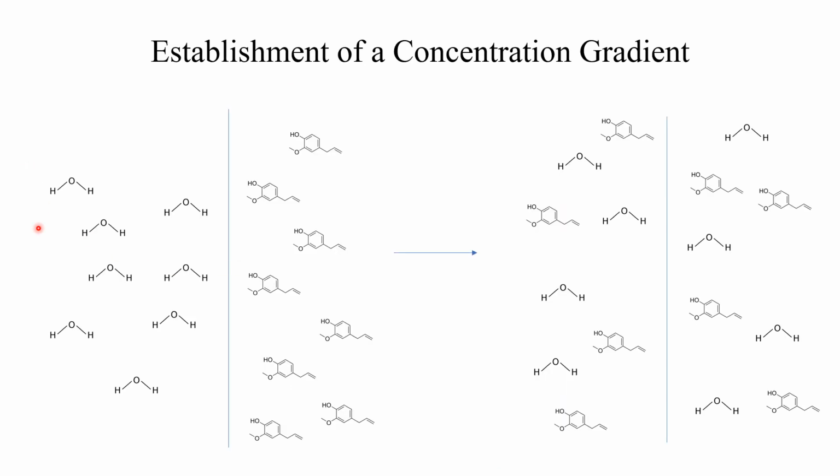Now, I know, very simple, but when we add water to our ground cloves, what happens is that, take this line here as just the physical barrier that is the cloves, or the dead cells of the cloves, what have you.